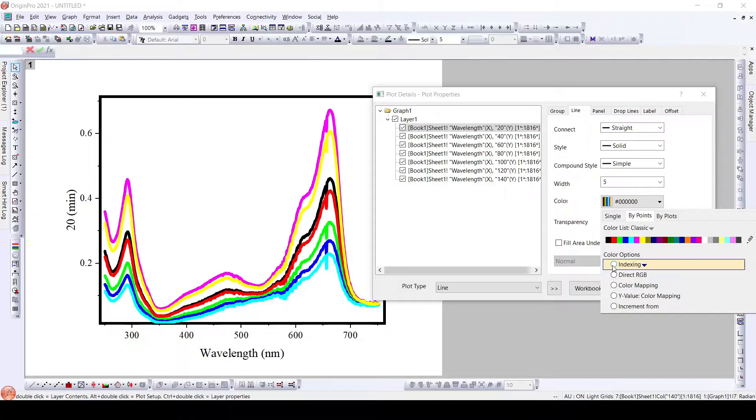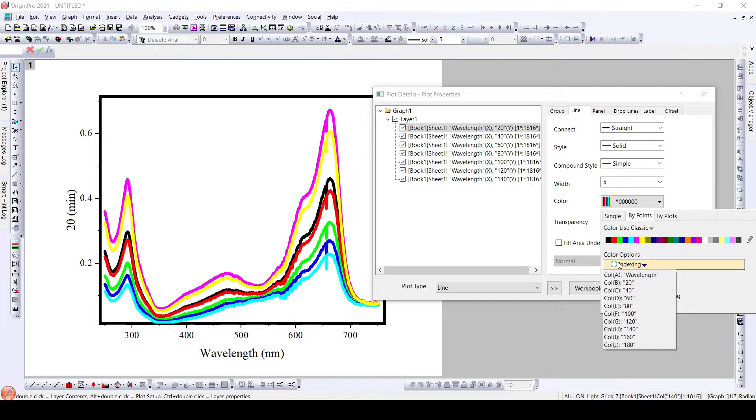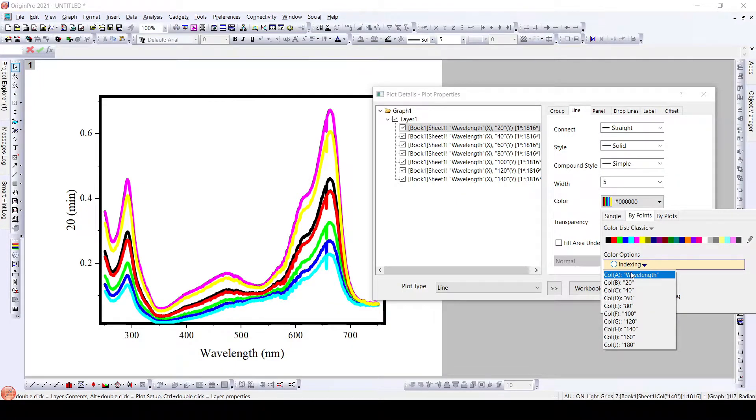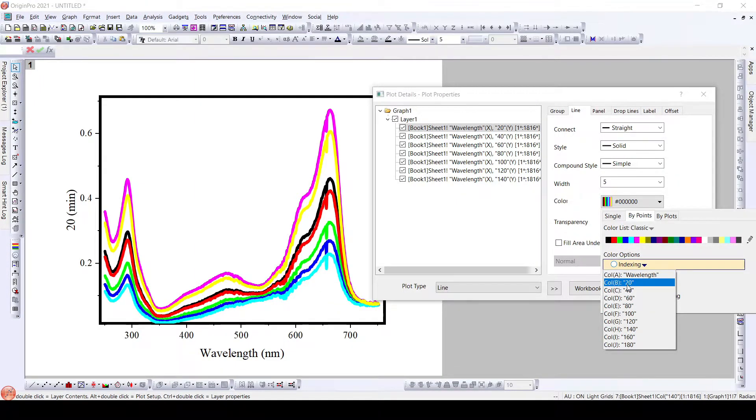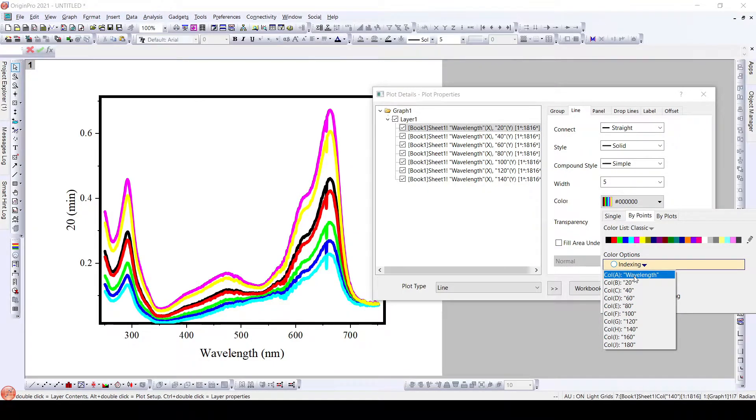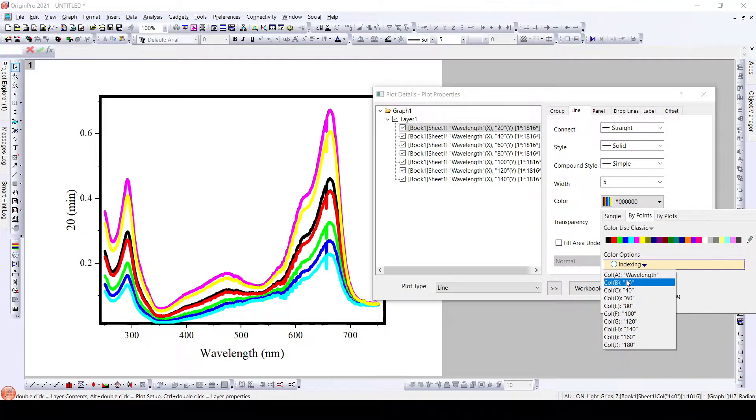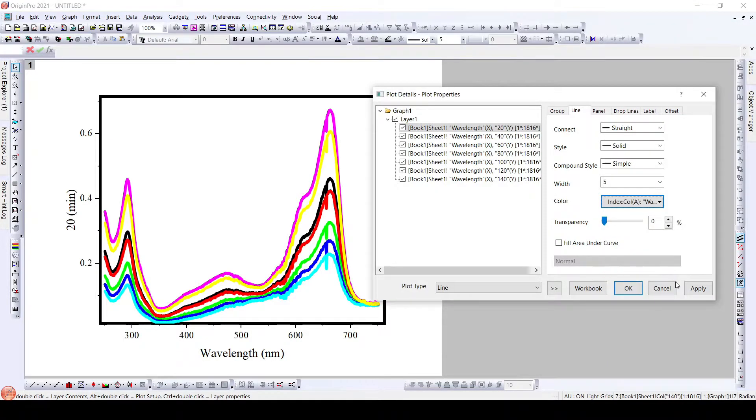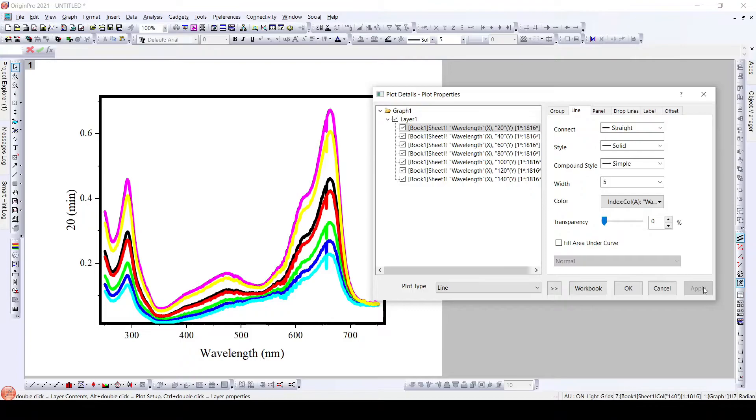When we click on indexing here, we have certain options based on the wavelength that is on the x-axis. We have wavelength, so we can color them based on the x-axis or on the y-axis, but for certain reasons we cannot use this y-axis but we can have x-axis. As we can see here wavelength apply.